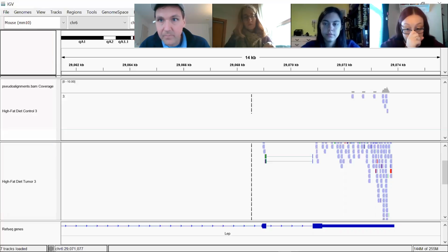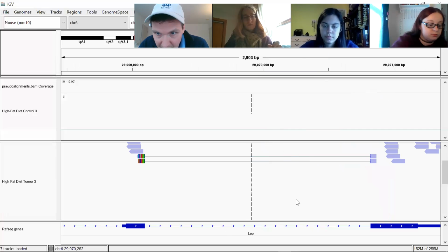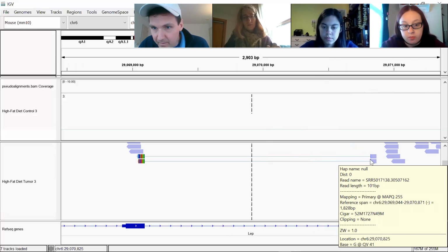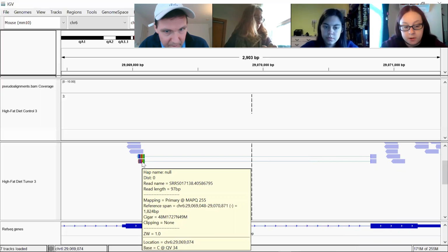Okay. I guess the one last point here is that it looks like some of these reads have been spliced, which means here's a read that was part of one exon, and then another exon, although there's something weird going on with this one. It's really pretty colorful.